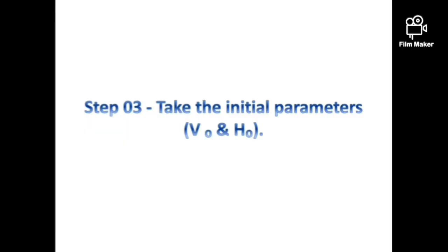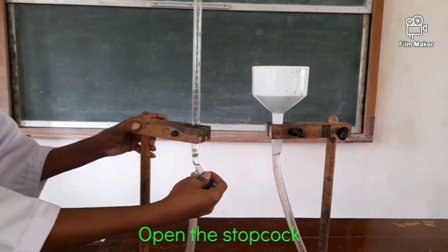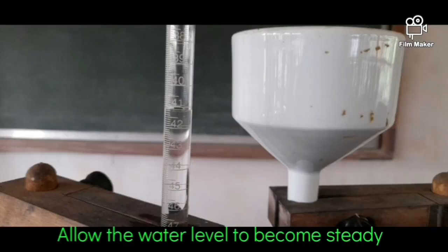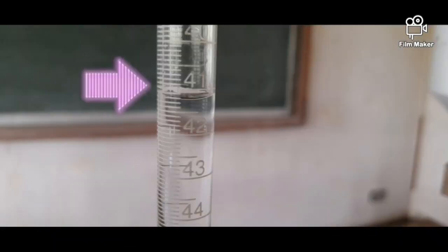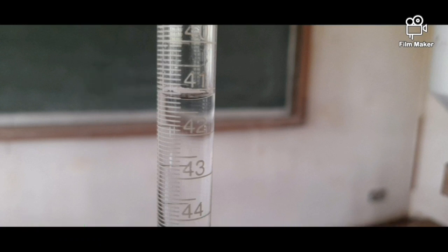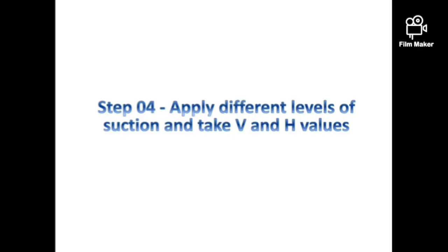Step 3. Take the initial parameters. Next, open the stopcock and let the water level in the burette become steady. At the steady point, you have to take the burette reading as V0. Now, record the distance from the datum level to the center of the soil sample as H0.